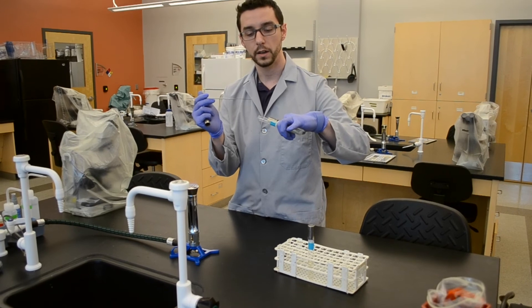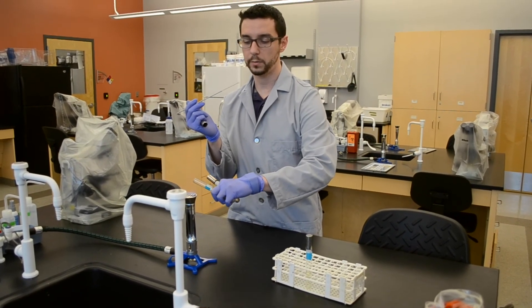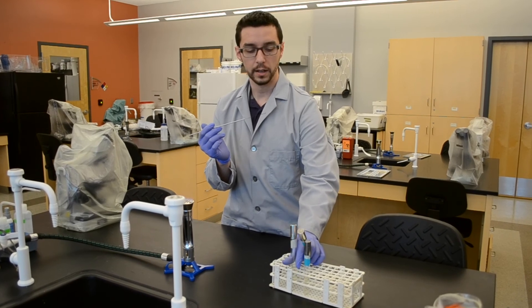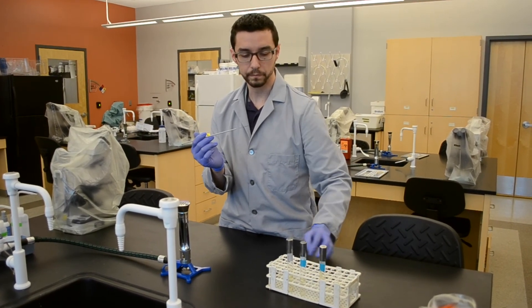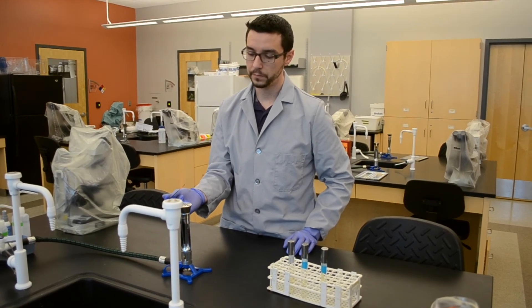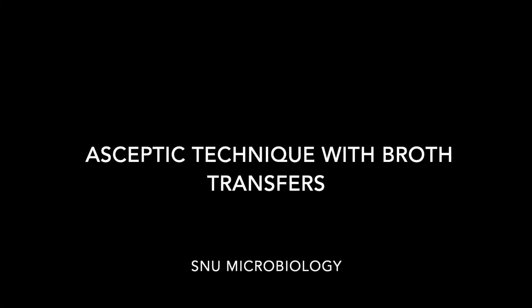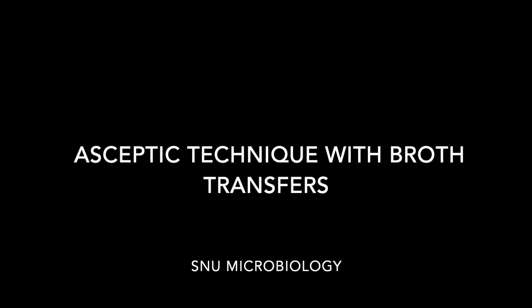If you press hard into that slant, it is just media and you can gouge it and make it less useful as a media for the test. Then make sure you sterilize again. And that's how you transfer from a source bacterial tube into a broth or into a slant.